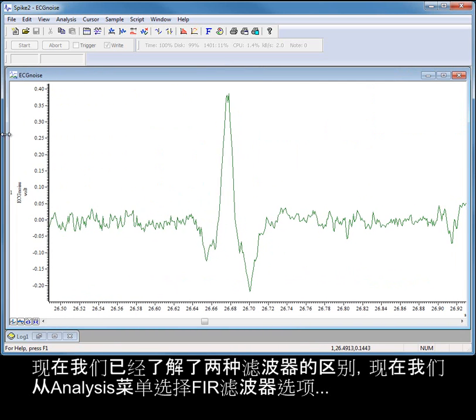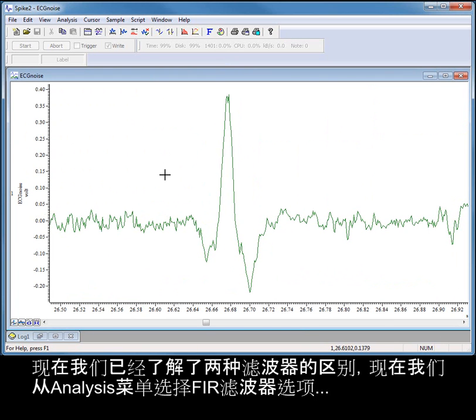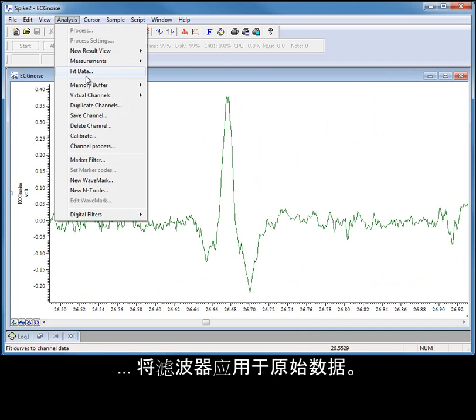Now that we've seen the main differences between the filter types, let's look at applying filters to our raw data by selecting the FIR filter option from the analysis menu.